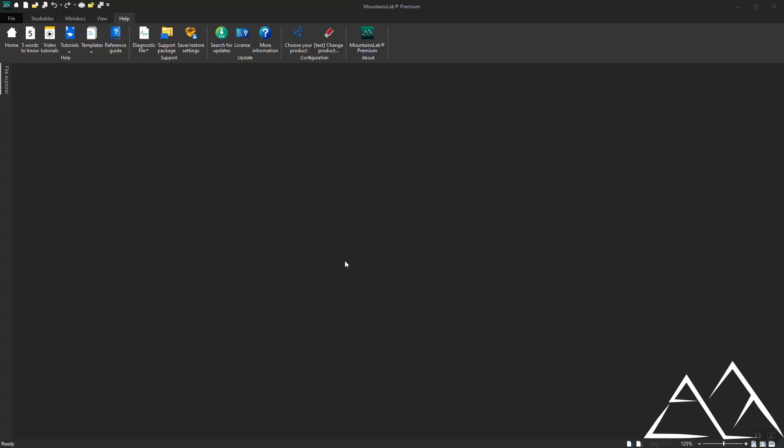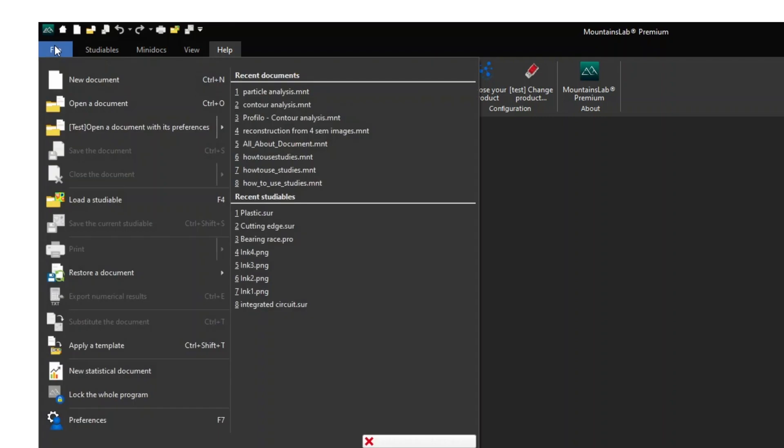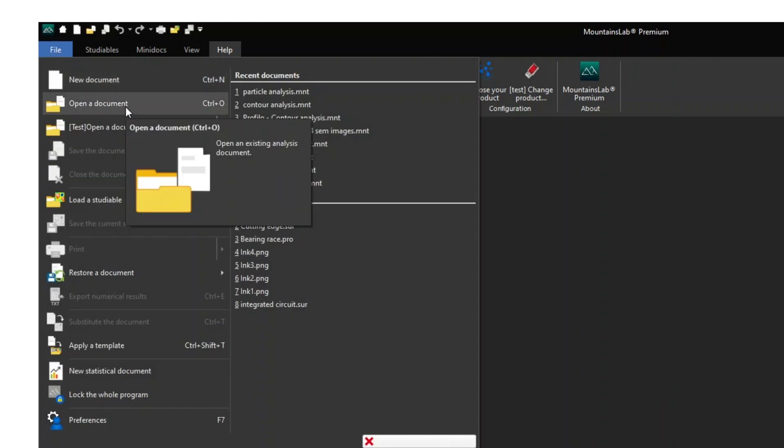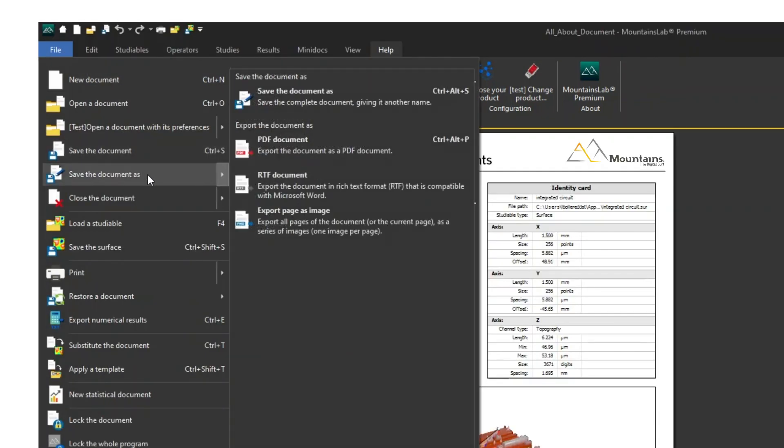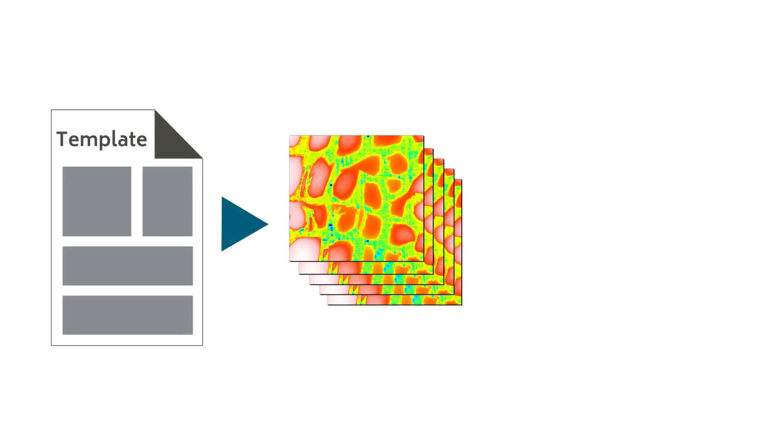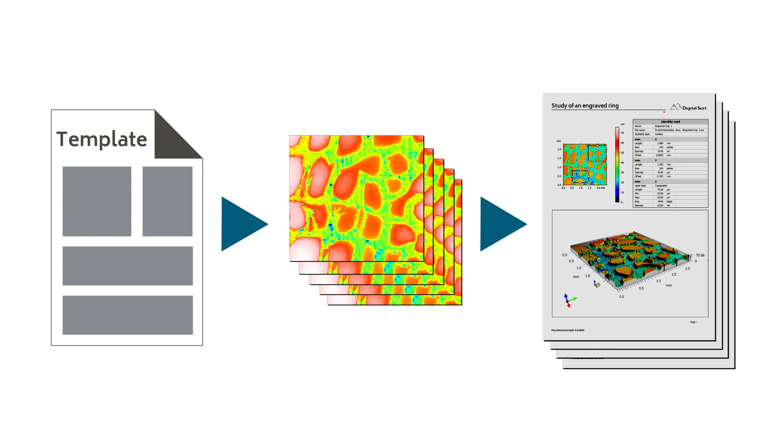You can open a document by going to File and Open a Document. You may save a document or export it in PDF or RTF format or as an image. Any document may be saved as a template and reapplied to other studyables at any time. This is very useful for processing large batches of data.